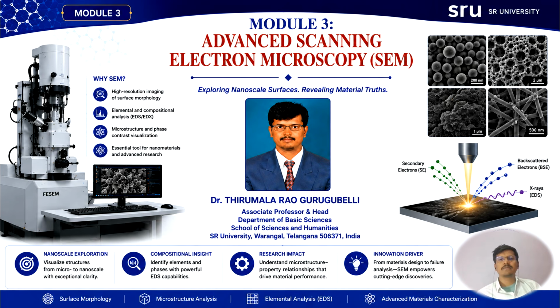Before discussing the technical aspects, let us first understand why SEM is so important in materials research. When we study materials at the nanoscale, conventional optical microscopes become insufficient because of their limited resolution.